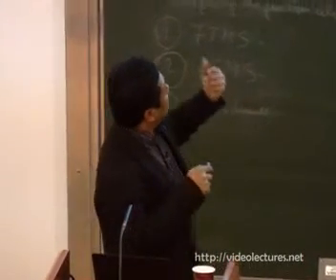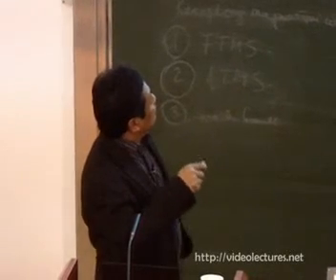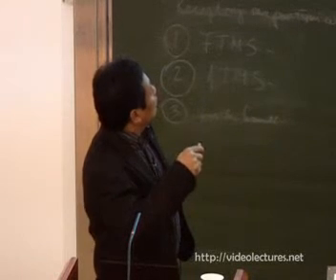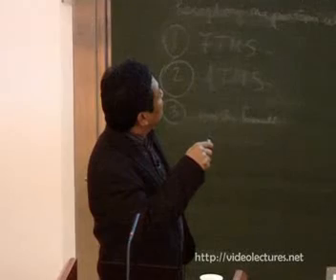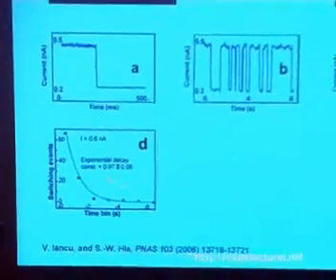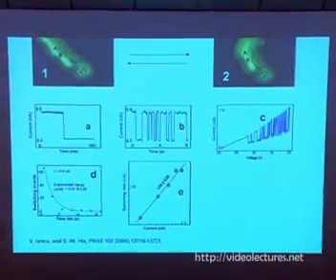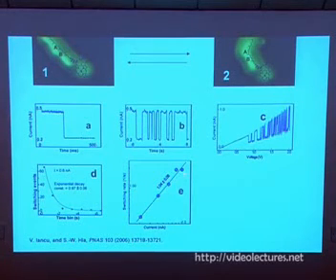And what we did is we use a fixed voltage and current, and we switch many of them. For example, this data was collected over 100 switching events at the fixed current and fixed voltage. For example, here about 70 molecules switch at this time, about 24 molecules switch at this time, and so on. It appears as an exponential decay in the curve, statistical analysis. From the exponential constant, we can calculate the time constant. And if we increase the current, we have another curve. Now at a different current, we have different switching rates.